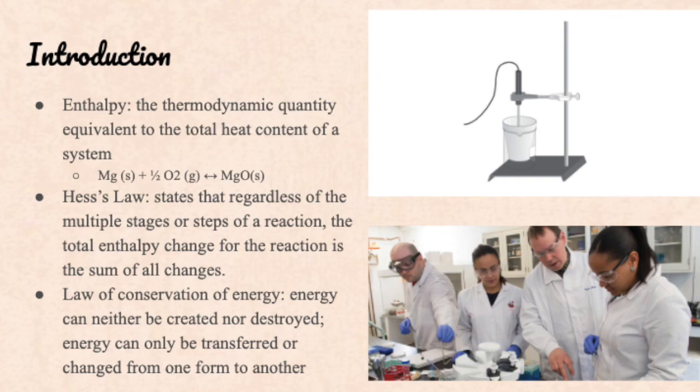As you see on the lab, I have 3 important concepts, and I'm going to try to verbally explain the interrelatedness between all 3 of them. As a reminder, the purpose of the lab is to discover the total enthalpy of the equation displayed. If you note the actual equation, you'll see that there are different reactant states, and at the end we end up with a solid.